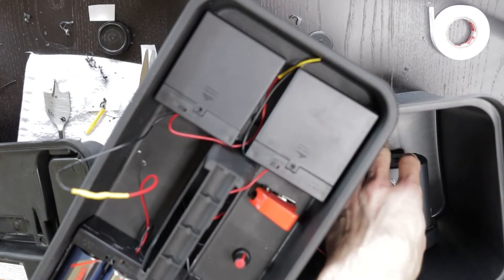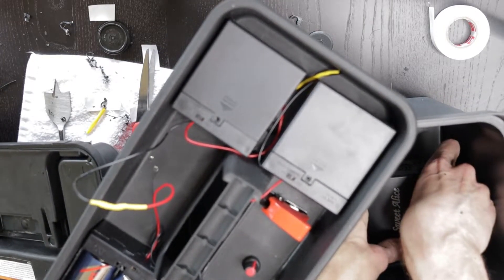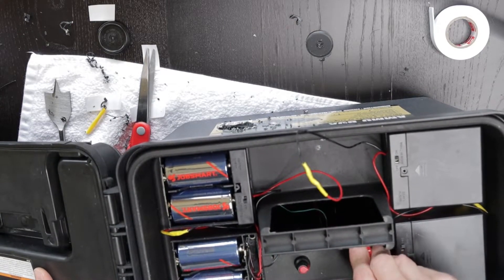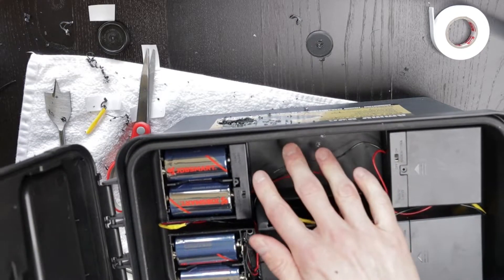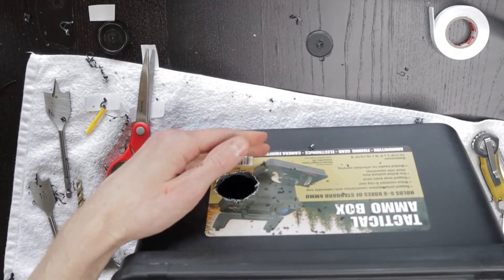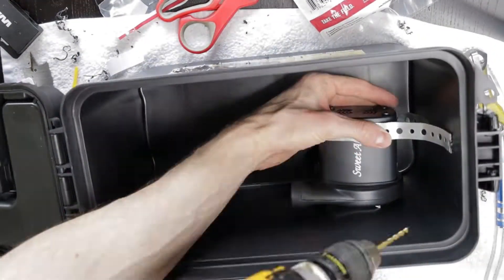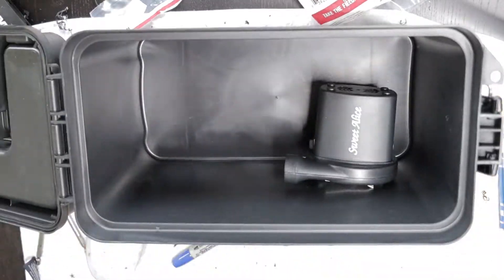Let's give this a test. I think I'm going to try and support this a little bit better. We've got airflow.